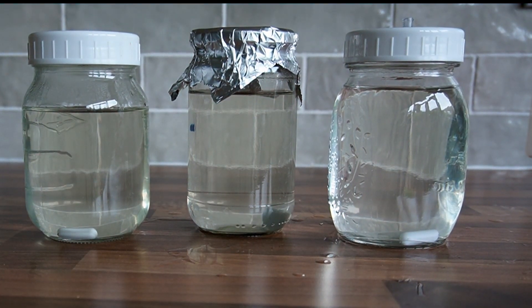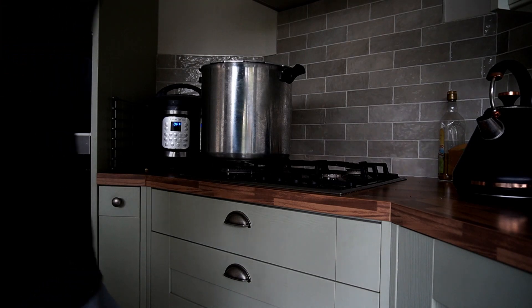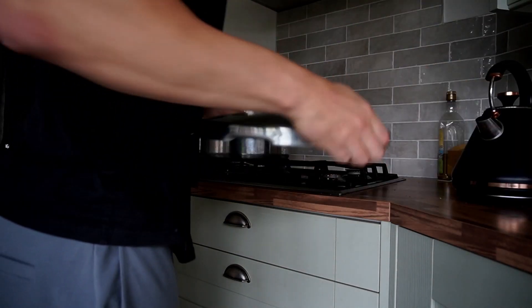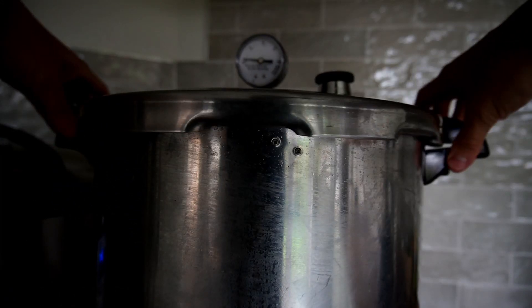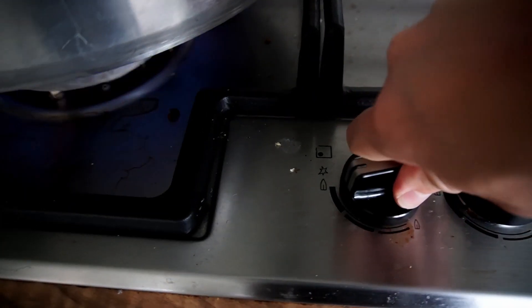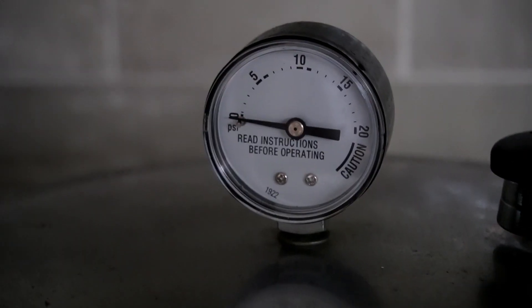Put foil over your lids and then pack the jars into a pressure cooker lined with a steaming rack. Add about 2,000 milliliters — that's two quarts — of water to the pressure cooker. Finally, sterilize at 15 psi for about 15 to 20 minutes.